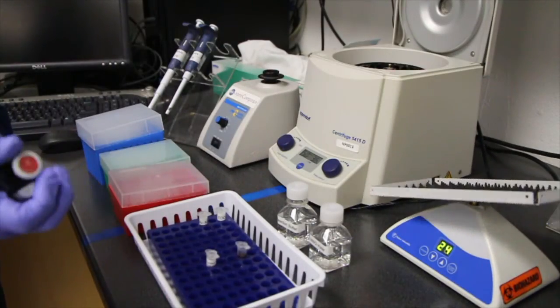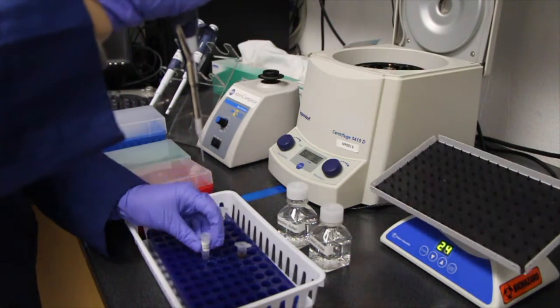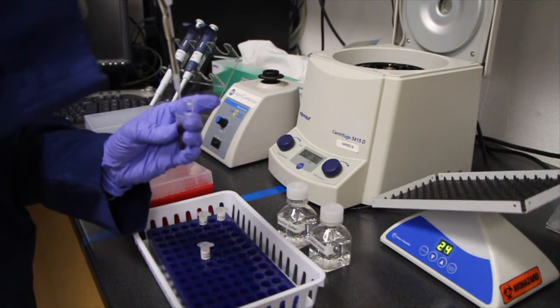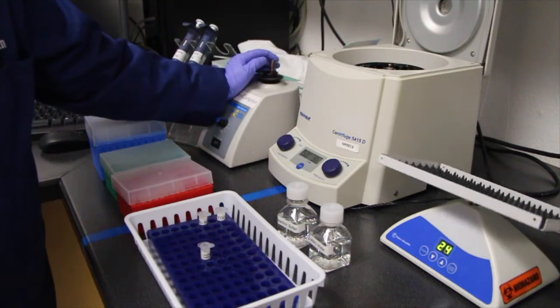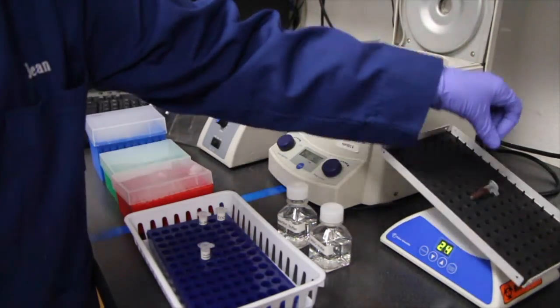Your particles are now activated, and you can add your purified antibody. For 1 ml of gold nanoshells, we recommend starting at around 20 micrograms of purified antibody per ml. Vortex to mix and incubate the antibody with the gold colloid for 1 hour.